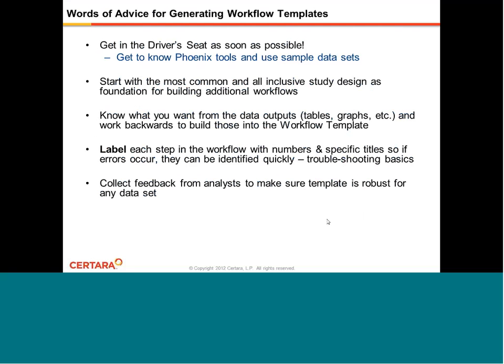So a few words of advice for generating these workflow templates: get to know the Phoenix tools and use sample data sets. Start with the most common and all-inclusive study design as the foundation for building additional workflows. And know what you want from the data outputs, and then that governs the choice of which type of tool is used to construct the workflow template.